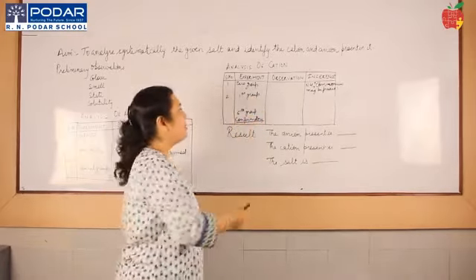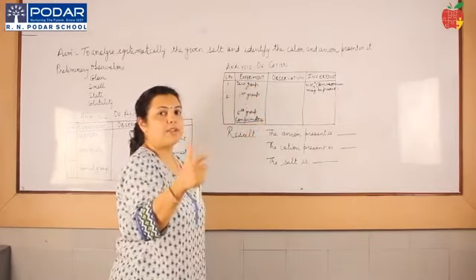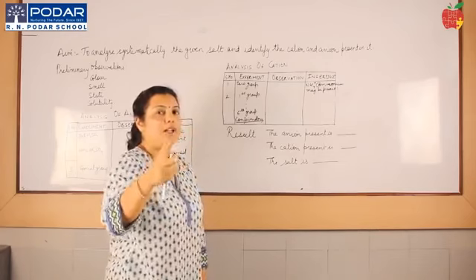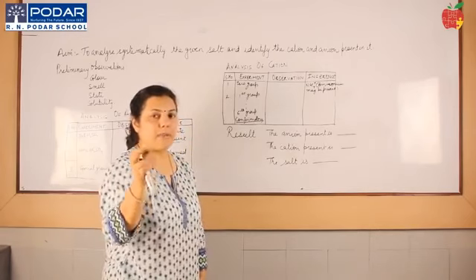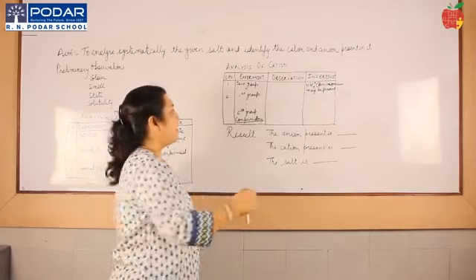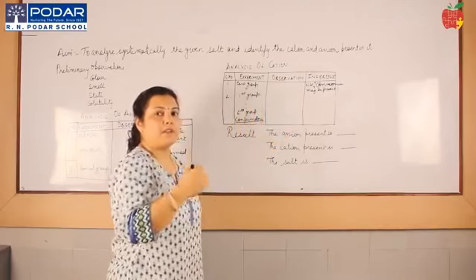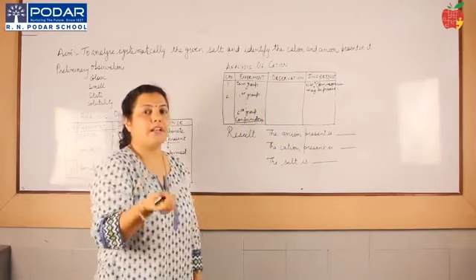Suppose it is magnesium, you will write down the negative test of all the previous groups. That means for zero group, first, second, third, fourth and fifth group. All negative tests have to be written. There are marks for it. If you don't write negative tests, your marks will be deducted. Till whatever point you get may be present, after that you have deduced which kind of radical could be there.